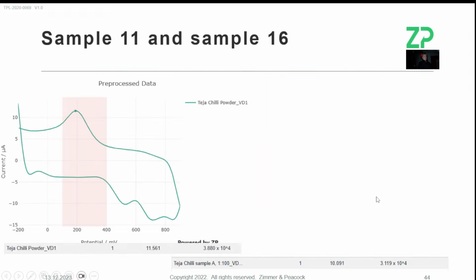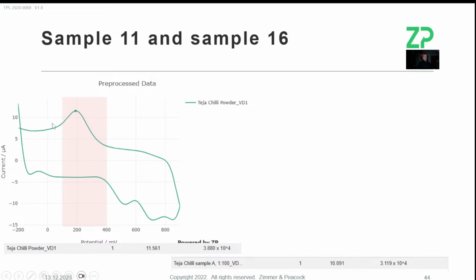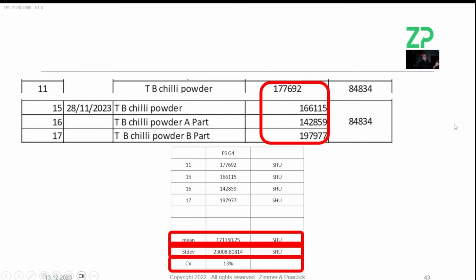Now, it's not the same number as your HPLC result, but when I look at the raw signal, it's huge. It's huge, okay? I'm telling you that the raw signal tells me it's huge. So it's not just this number's coming from nowhere. It's huge, and you did it 4 times approximately. So I'm sorry, but the body of data is actually in support of the FoodSense, because the raw data shows you can go through the slides and you can see that none of these peaks are like this. These are huge. So by far, the TB is your hottest product, because I can see it in the raw signal. So when you get this kind of 84,000 from the HPLC, you've no transparency on that.